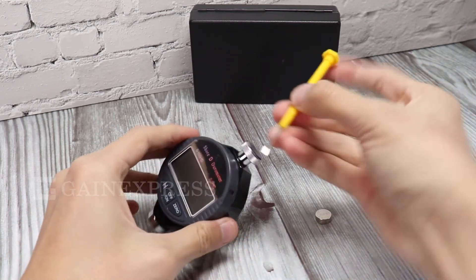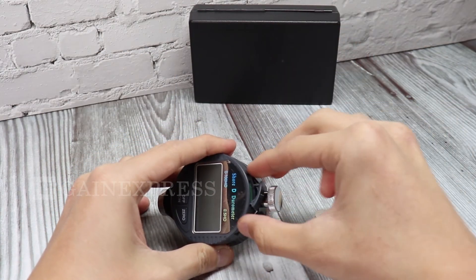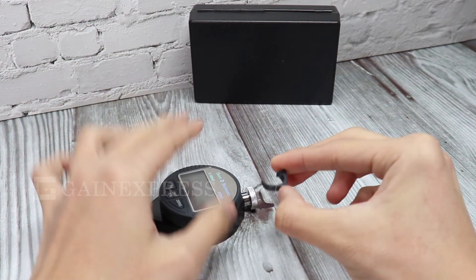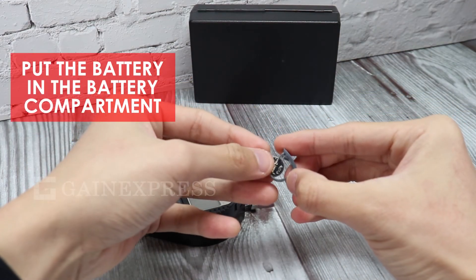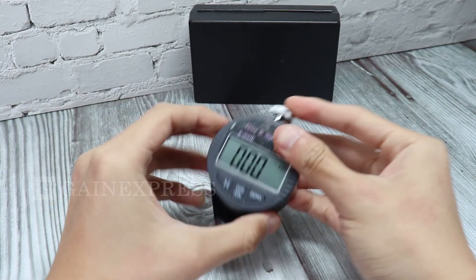To place the battery in the unit, take off the battery cover. Put the battery in the battery compartment and put the cover back on the unit.